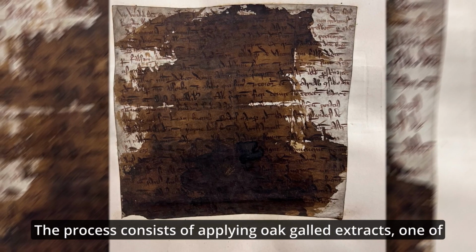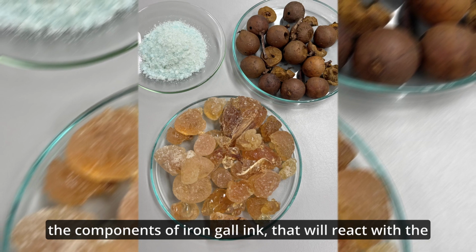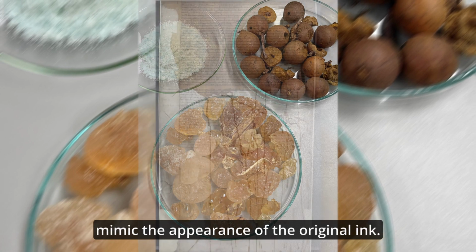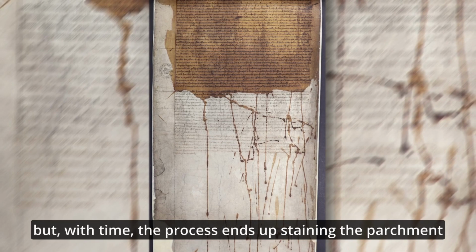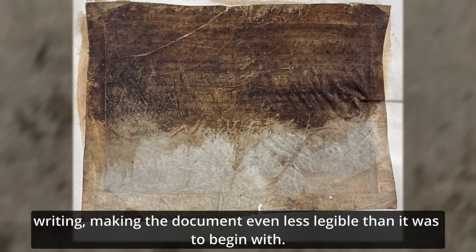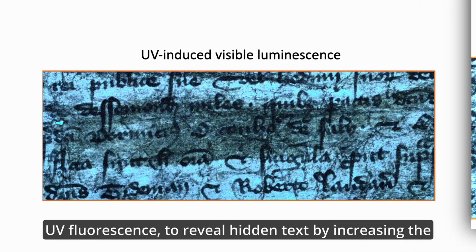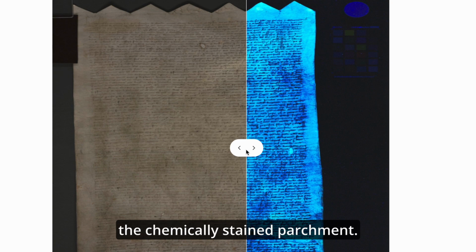The process consists of applying oak gall extract, one of the components of iron gall ink, that will react with the remaining iron from the faded ink to mimic the appearance of the original ink. In the short term, it increases the clarity of the handwriting, but with time, the process ends up staining the parchment, turning it brown or blue, and conceals the original writing, making the document even less legible than it was to begin with. We use a method called UV-induced visible luminescence, or UV fluorescence, to reveal hidden text by increasing the contrast between the ink and the chemically stained parchment.